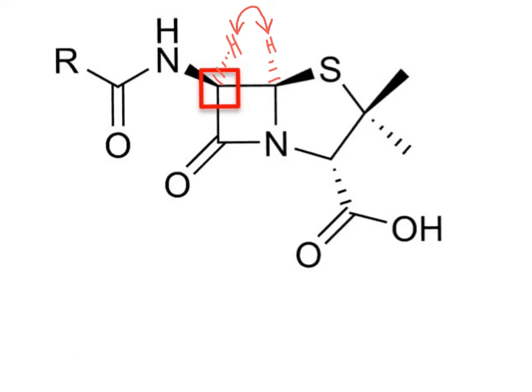On the other hand, for the HMBC correlations, if we take a look at our proton of interest here in blue, and we look for carbons that are 2 to 4 bonds away. So starting with the carbons that are 2 bonds away, to be systematic here, here's a carbon that's 2 bonds away, so I'm drawing an arrow to it. Here is a carbon that is 2 bonds away, so I'm drawing an arrow to it.